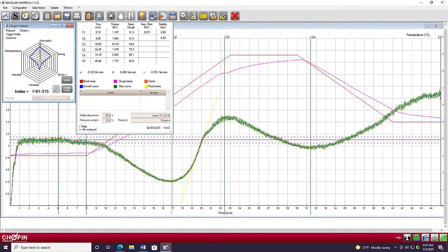Viscosity at high temperature, so this particular peak in the curve, also indicated by the C3 value, does give an indication of product color specifically because it's impacted by amylase. And we will see the impact of amylase activity through the peak of this curve here.